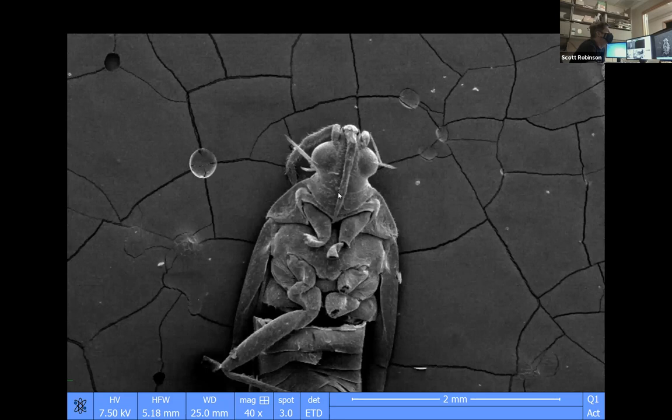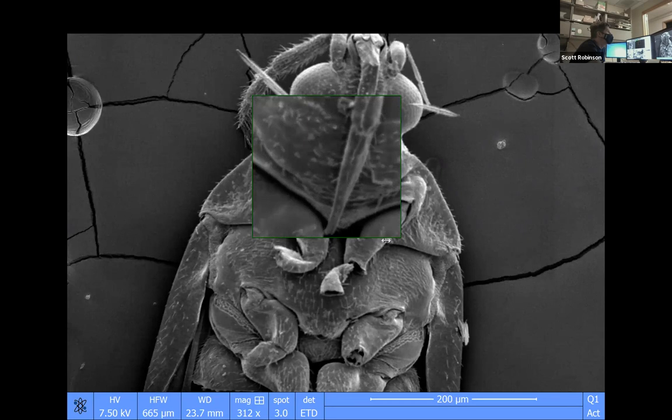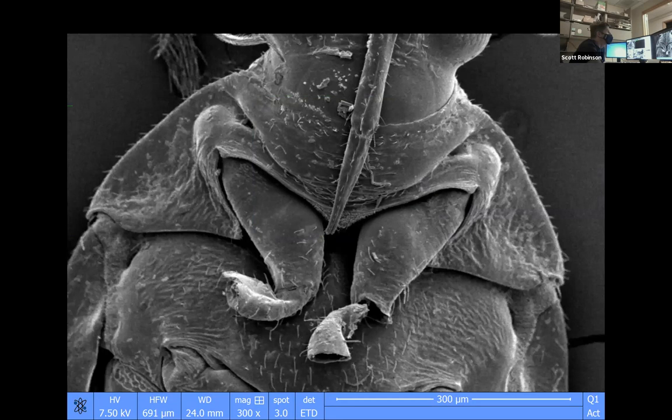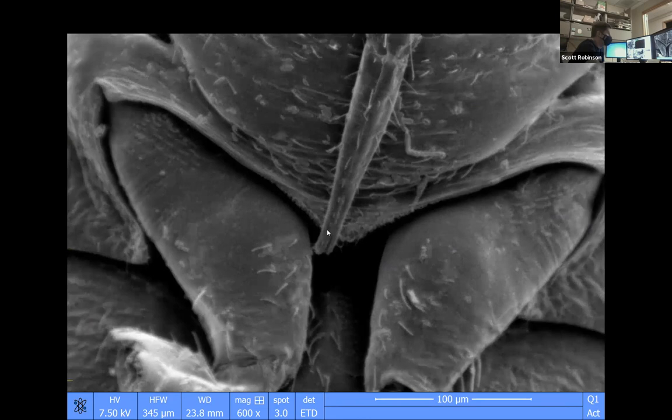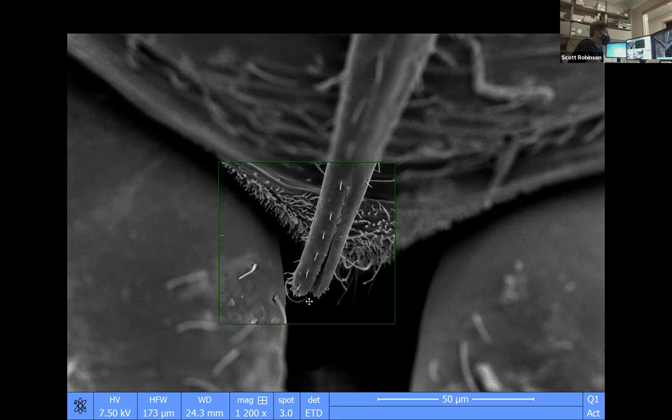And we can see its rostrum. This is the same kind of biting mouth parts that it can move forward. It doesn't just lie against the underpart of the body like that. So this is the rostrum right here. And it's the same kind of thing that a bed bug has when it bites. It's split at the tip and has a little sharp piece that comes out.